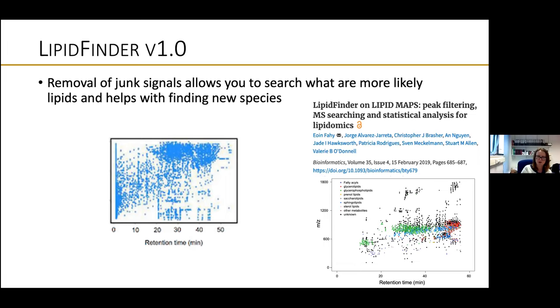So we know, like we discussed earlier in the week, when lipids change due to metabolic changes in tissues, they tend to change in groups. They don't change with one PC and none of the other PCs change. They will tend to either go up as a group or down as a group. So the reasoning behind this was that if we annotate them to putative categories, we can then do statistics on those categories and look for patterns and see what's changing.